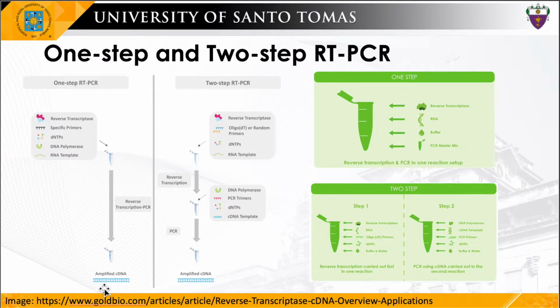So this uses a reverse transcriptase along with a DNA polymerase. The RT-qPCR only utilizes sequence-specific primers, as mentioned before. This is for assessing many RNA samples and high-throughput applications. This is the best method when only a few assays are run repeatedly. Okay, so those are the uses.